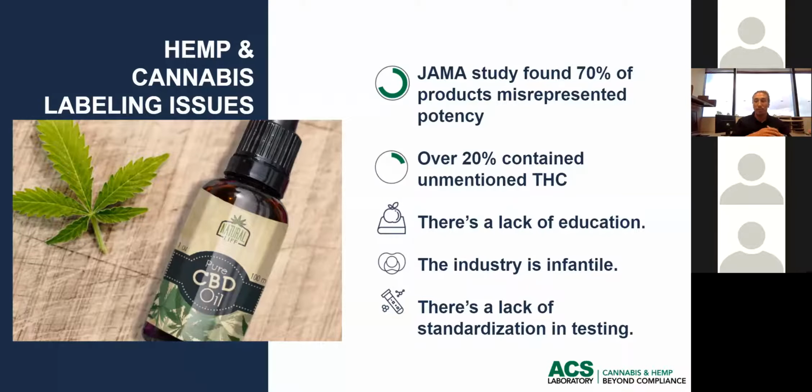So really through proper testing and proper certificate of analysis, we can actually accurately attribute products to what their ingredients are, make accurate label claims there, and help consumers have the confidence and transparency to know the product they're going with is safe and that it's properly tested and that it's true to the label claim. But a large part of that is due to the lack of education in the industry.